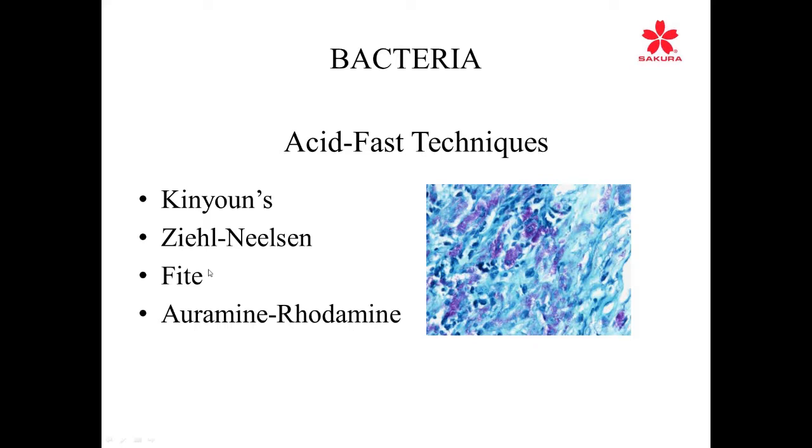With one of the procedures, the Fite method, and we see this in the earlier methods of the Luna manual that was produced by the AFIP in the early 70s. This method, the Fite method, requires the use of a peanut oil and xylene mixture before you start the staining process. Now, the reason for this is that, as I mentioned before, some of the organisms are very large, and they have a huge lipid layer.